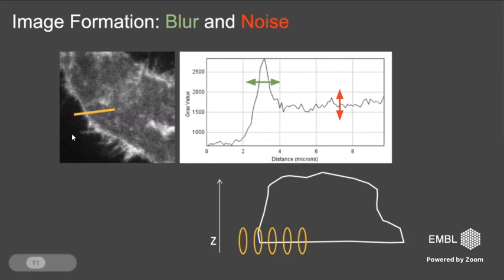So in fact, that the signal is brighter at the cell edge, yeah, that could be very interesting biology at first glance, but maybe it's just an artifact of how the geometry of your object is situated with respect to the point spread function of your microscope. So this is very, very important to always draw these little sketches like I did and think about what these signals really mean. Otherwise, you run a great risk of misinterpreting this data.